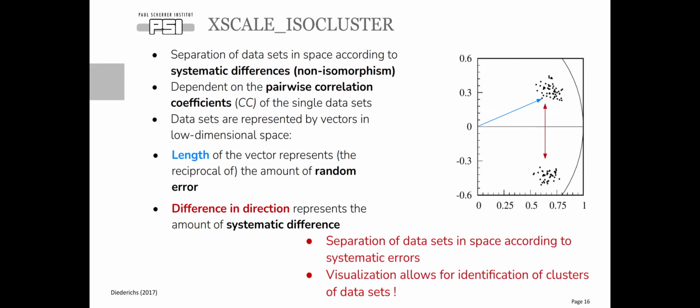So just to sum this up, I think the visualization is really nice because you can easily see if some data sets fit to each other or not. For example, here, this is obviously an indexing issue, so this is super easy to see. And you can also use this if you don't have any indexing problems, but have different systematic uncertainties in your data sets.